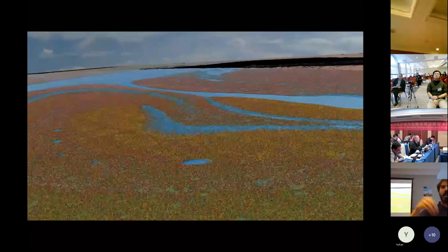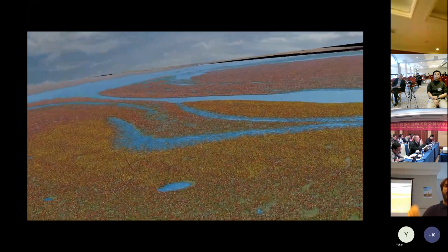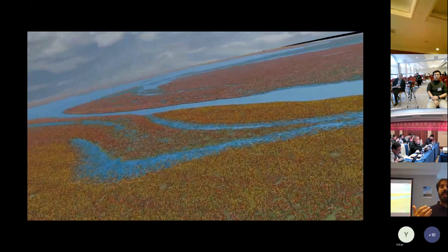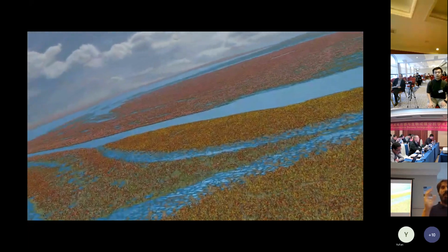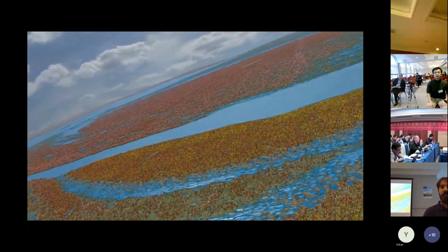So you can see 50 million flowers, everything as a big flower field, where the different types of flowers are the different types of puncta. This can communicate that the puncta are not just distributed randomly in the brain; it might look slightly chaotic, but there is actually structure and organization underneath.